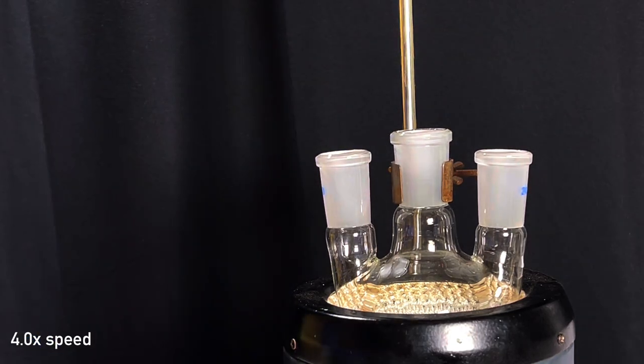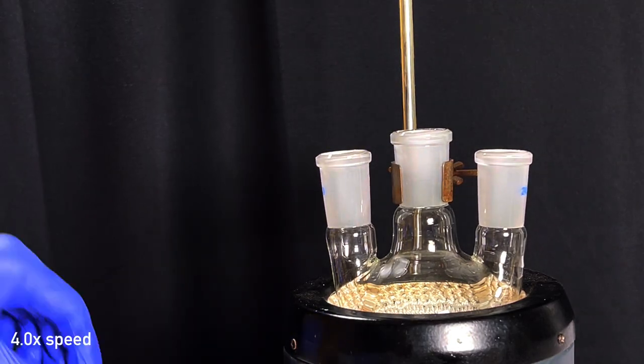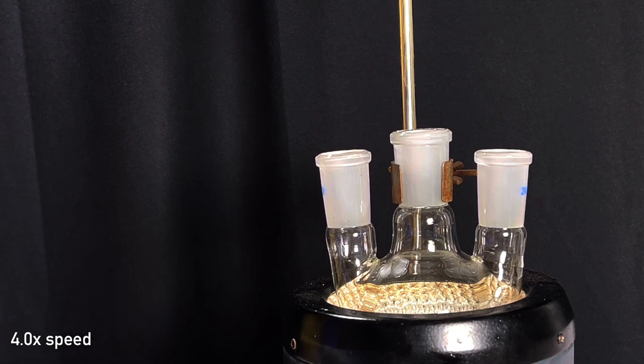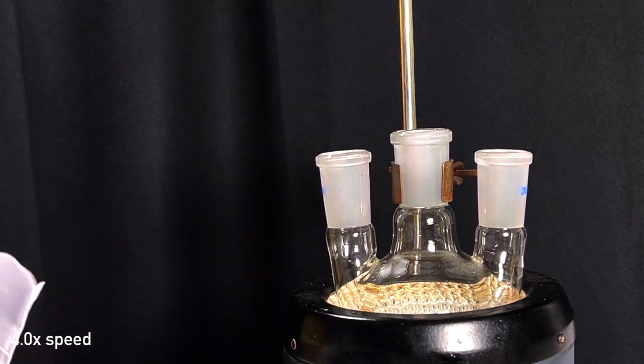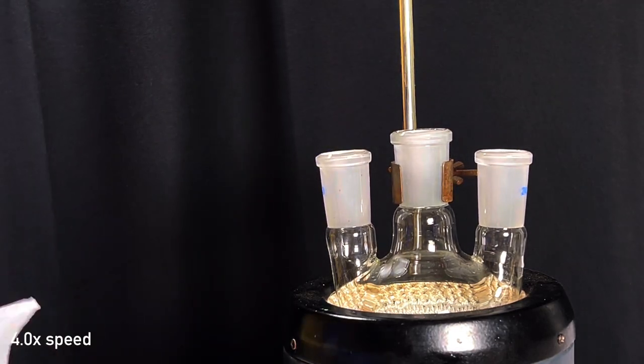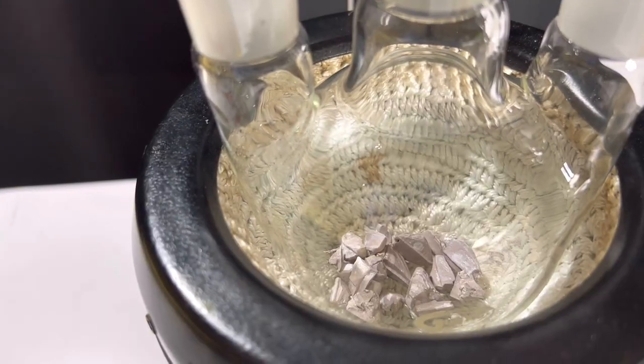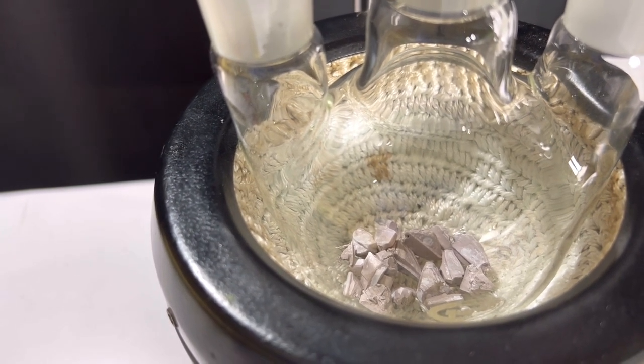Sodium has to be first dried from the mineral oil using filter paper and then the outer layer was removed by cutting it out. This will expose the silvery outer surface. This is after the addition of the whole sodium metal.